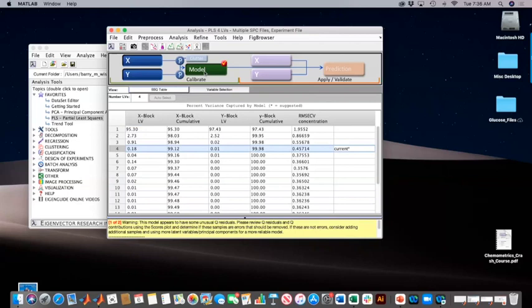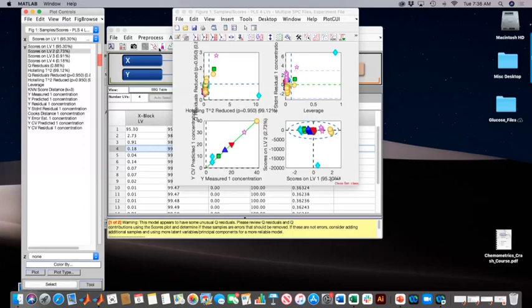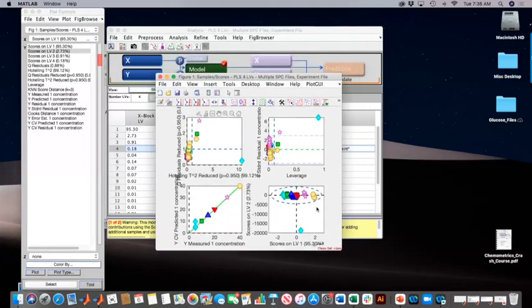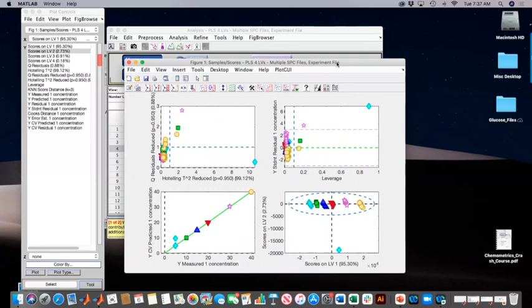Okay, great. All right, so let's look at my scores plots, and that's the Erlenmeyer flask. So I just clicked on the Erlenmeyer flask. And actually this comes up with, now, because I'm using the one that has classes in it, class symbols here. And I can also have a legend in this, which I created for this. So here's my 5 through 40 milligram samples and their symbols right there. So what do I see here? I'm going to turn the legend off.